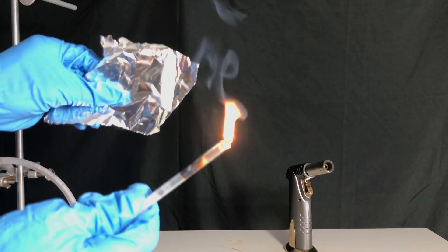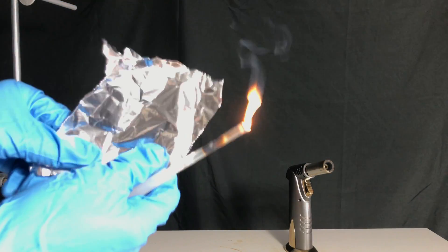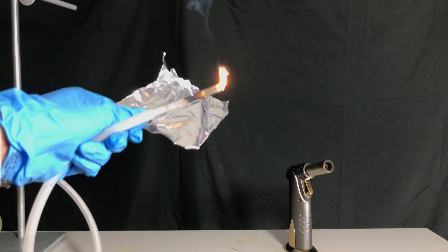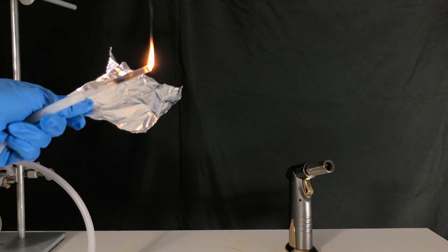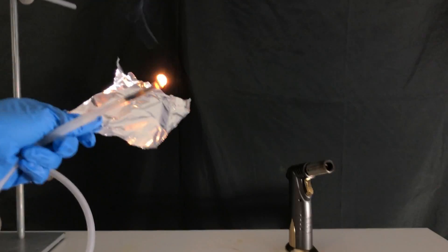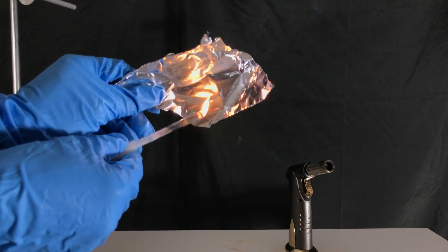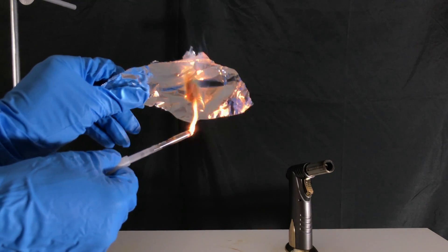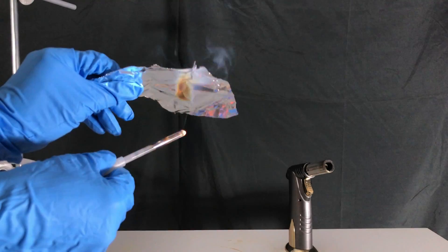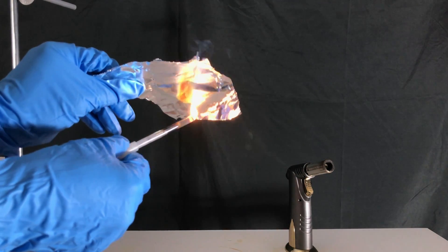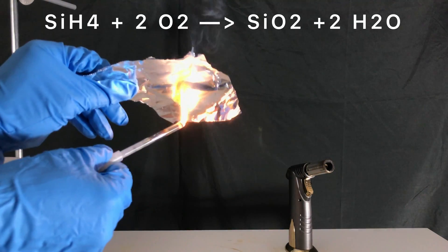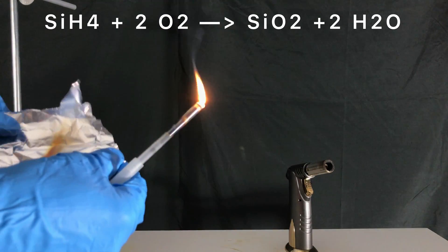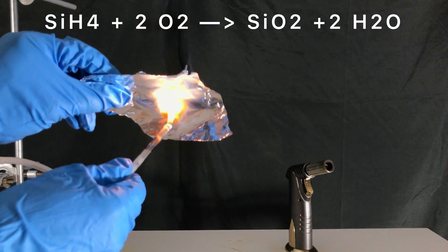To make the sand that is formed even more visible, I took a piece of aluminum foil and just held it to our silane flame. The whitish and brown stuff that settled on the aluminum foil is silicon dioxide.